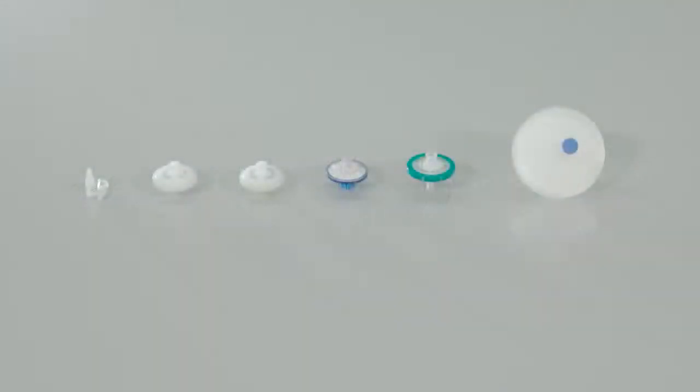For reference, the following Millex filters are unidirectional: 4mm, 25mm automation compatible, 25mm HPF Millex filters, Cathivex, and 50mm Millex syringe filters.